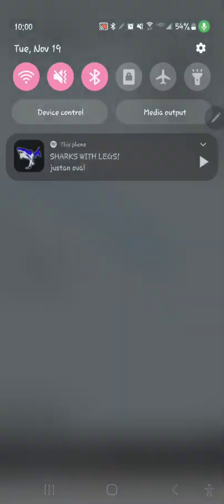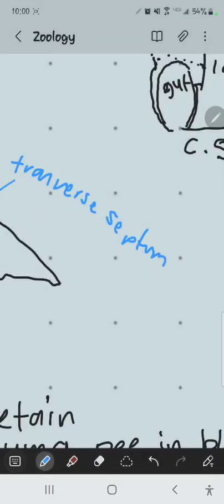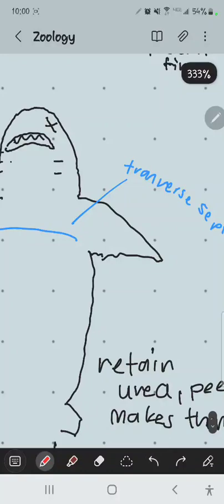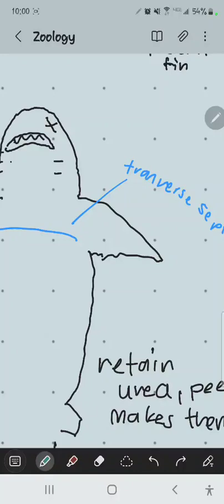First thing you're going to see is the liver kind of fills this whole thing up. So just pull the liver, there's two lobes of the liver. Pull the liver to the side. So I'll draw the gut first, and then I'll show you the liver. So the gut tract of every vertebrate basically has the same parts. So that's kind of cool. There's a big homology in all the vertebrates. The guts all look remarkably similar.